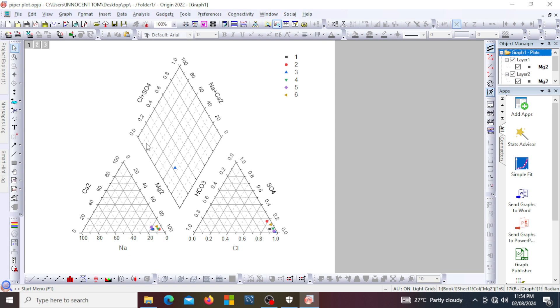So how do we interpret this Piper plot? If the data point falls near the sodium vertices, the water is sodium dominated. If it falls near the calcium vertices, it is calcium dominated. So wherever it falls, that ion dominates the water. In the case we have here, our data point falls between magnesium and sodium.